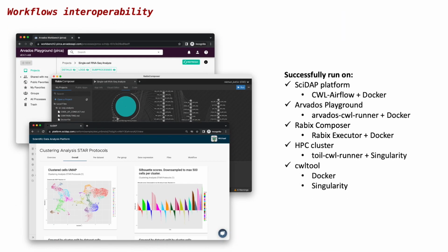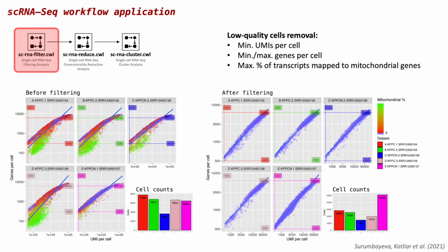To assess reproducibility and interoperability of our tools, we combine them into single-cell RNA-seq pipeline and run it in several workflow execution environments that support CWL specification. All runs finished successfully and produced identical results in a reasonable time. As a real use case scenario, we applied our single-cell RNA-seq pipeline in the study of pancreatic cancer differentiation. The results of the project have been recently published in the STAR Protocol journal.